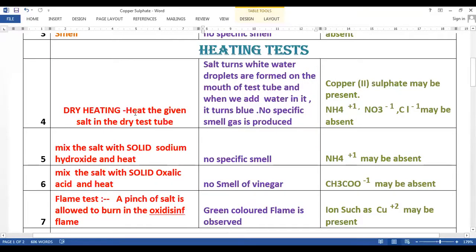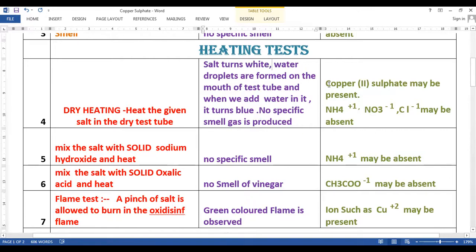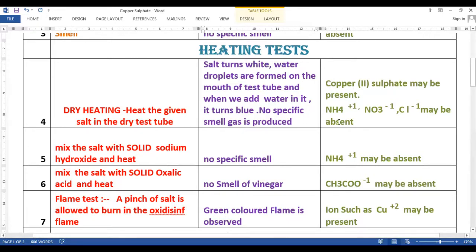So we have seen the dry heating test. In the dry heating test, we heat the given salt in a dry test tube. What we observe is the salt turns white in colour, water droplets are formed at the mouth of the test tube, and when we add water it turns blue. There is no specific smell or gas produced during this experiment. This is characteristic of copper(II) sulphate, so we can assume that copper(II) sulphate may be present as the given salt.